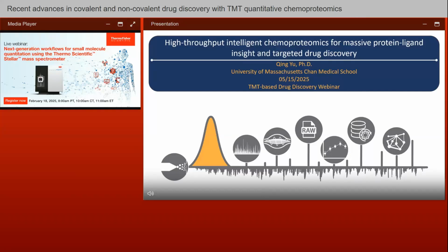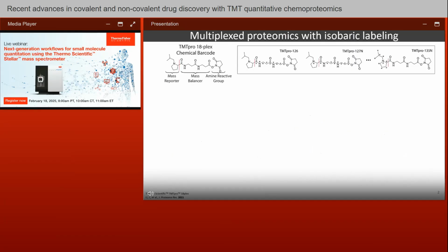Good morning, everybody. Thanks for joining me in this webinar, and thanks Thermo for organizing this opportunity for us to share some of the research we're doing. So to start with, this is a TMT based drug discovery webinar. I do want to refresh everybody in terms of what TMT is.